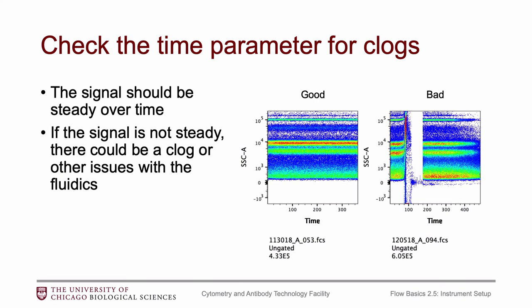Since we're talking about flow rate, also check the time parameter on your samples. Across time on any parameter, you'd expect the signal to be very stable. Check your samples and make sure you have a stable signal over time. If you see any sort of instability — like a dramatic interruption and recovery — that could indicate fluidics issues, probably a clog in the sample that pushed through on its own. Sometimes you'll just see a small blip, but if anything doesn't look steady on the time parameter, you probably had some fluidics issues.